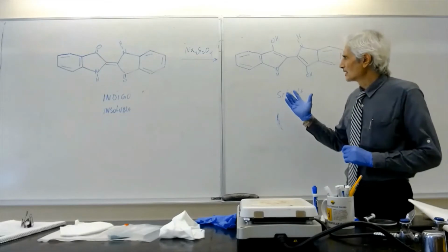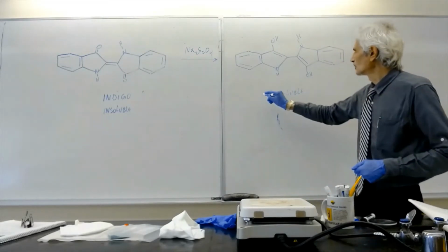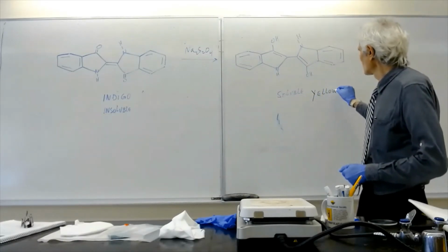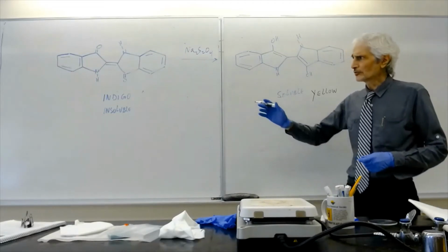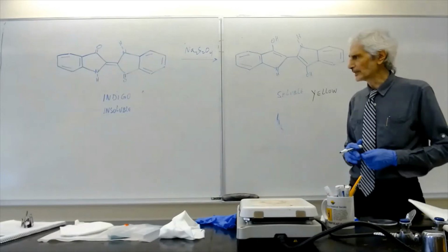This soluble dye, by the way, has a yellow color, and of course indigo is the color of indigo, a very, very deep blue, right?